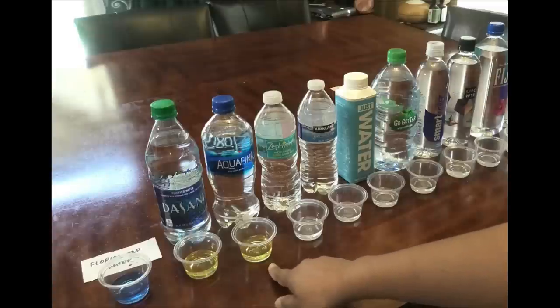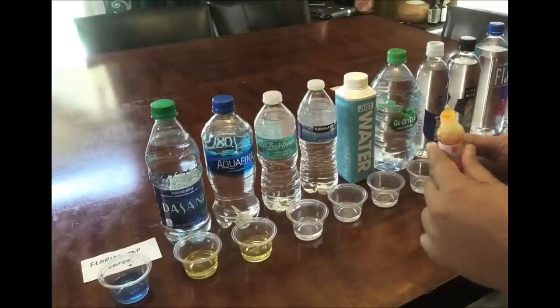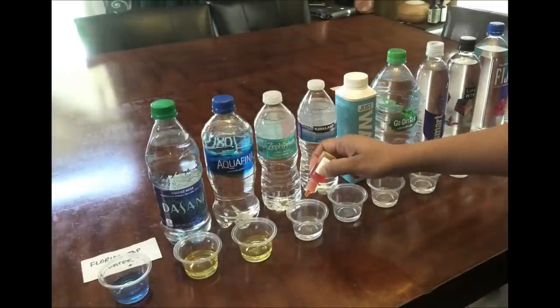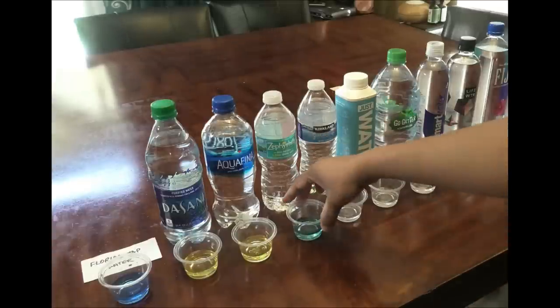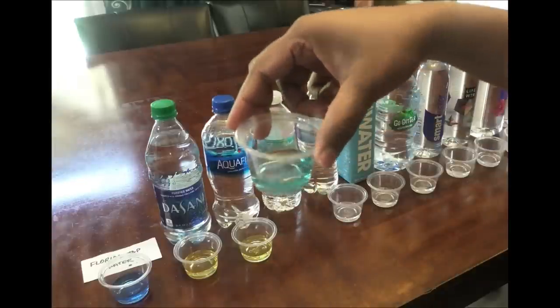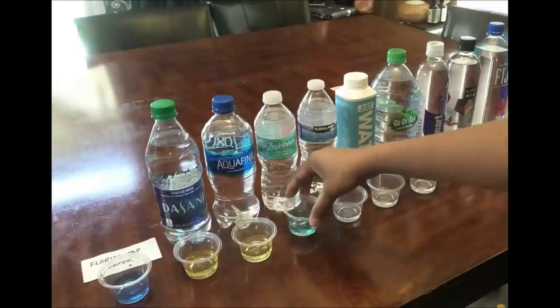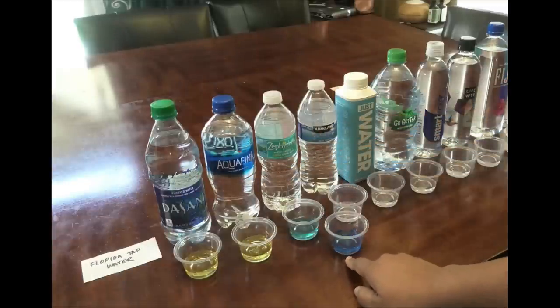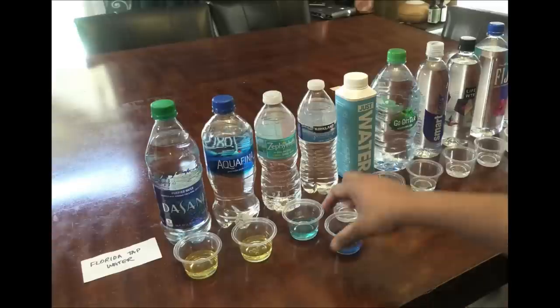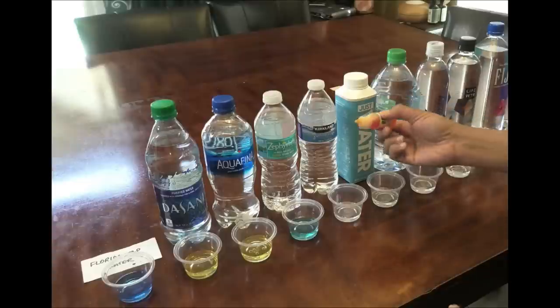Aquafina is also the same color as the Dasani, which means it's acidic at a pH of 5.0. The next water is Zephyr Hills — we only use Zephyr Hills in our home. The Zephyr Hills is blue, but it's a very light blue. Compared to the Florida tap water, the Florida tap water is much more alkaline than the Zephyr Hills. Next is the Kirkland.